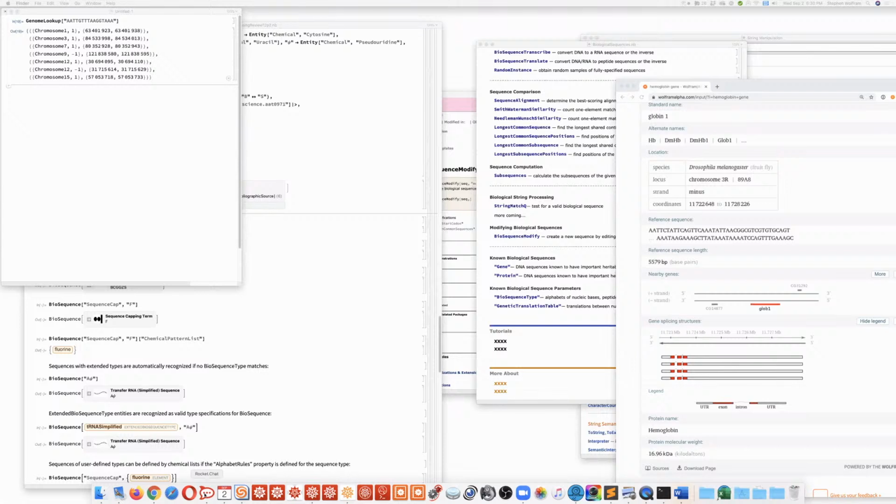You either take out those characters or you just have the... There's a post 12.2 structure, which is unfortunately broken right now, called embedded biosequence for this purpose. Where you say we have some larger reference feature or some larger entity, and we're just talking about where the coordinates are, and from it you can get back what sequence you are referring to, what its flanking sequences are, what strand it is on, all this kind of good stuff.